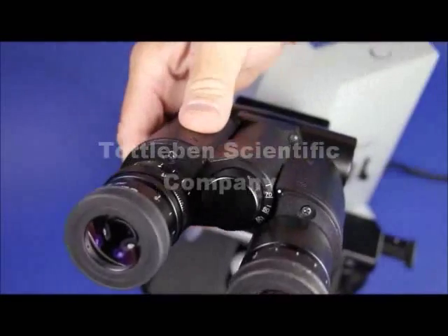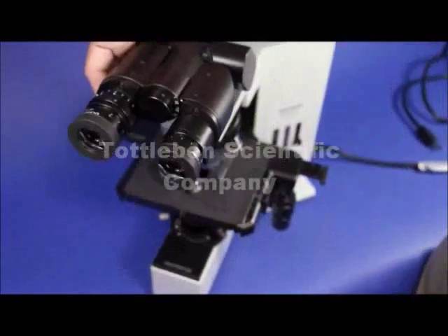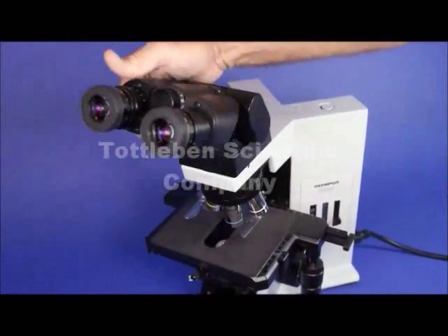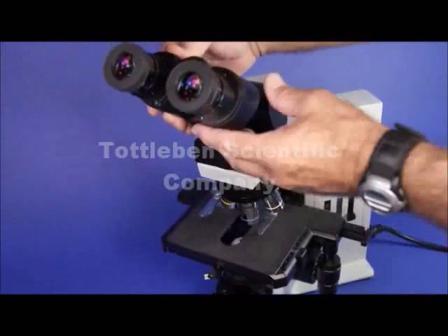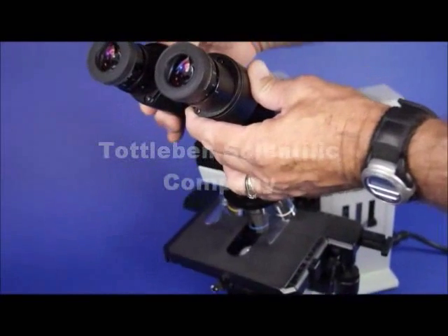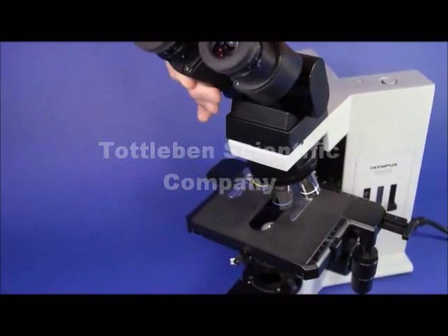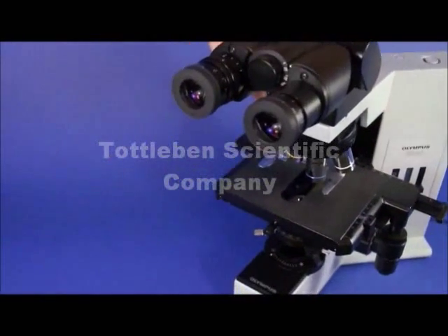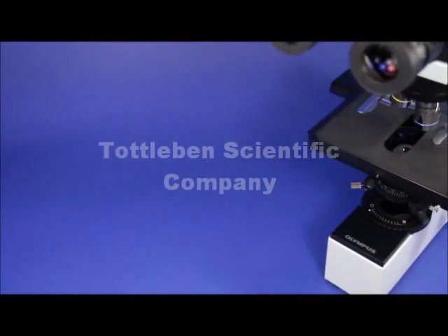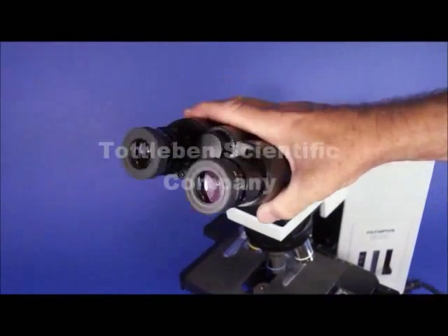This has a 0 to 60 inclinable head — we call them ergo binos, but most people call them inclinable heads. The beauty of this is that it affords the user comfort, so you can sit and do your microscopy in total comfort and have the microscope come to you rather than you forcing yourself to come to the microscope. This feature alone costs about $2,500 if you buy it new from Olympus.